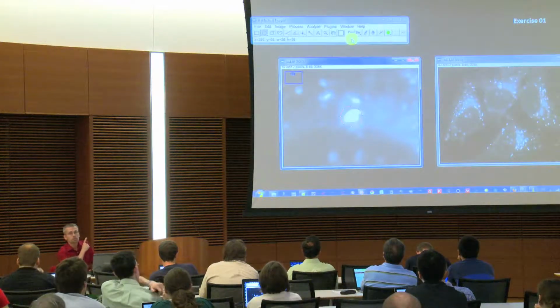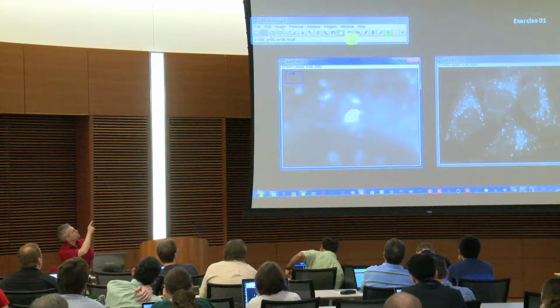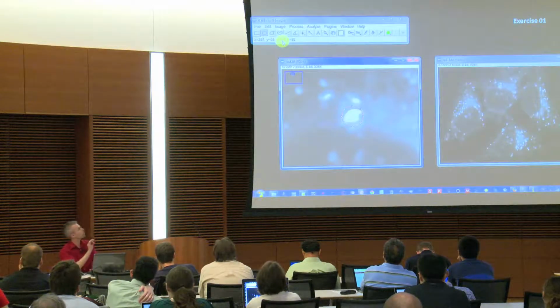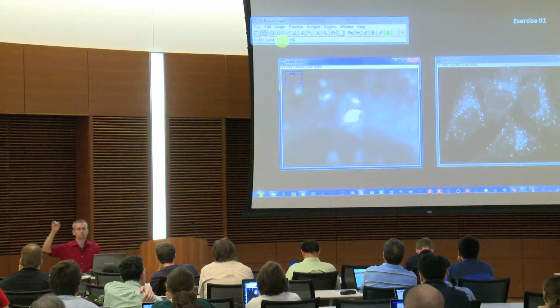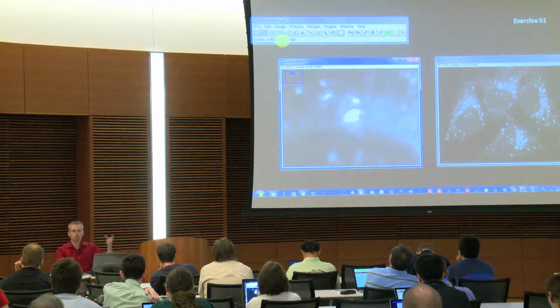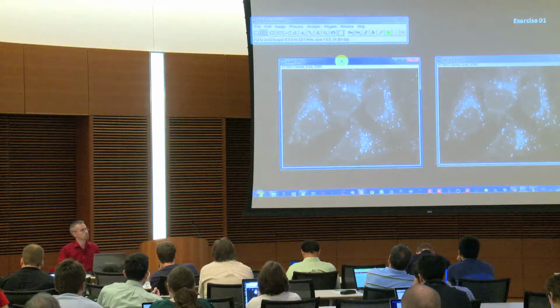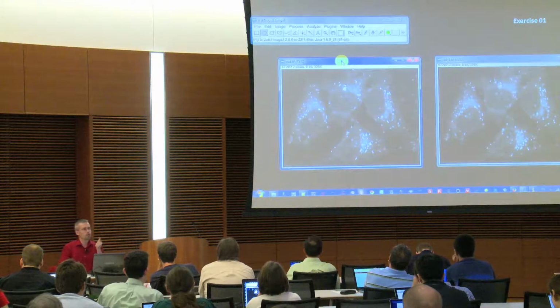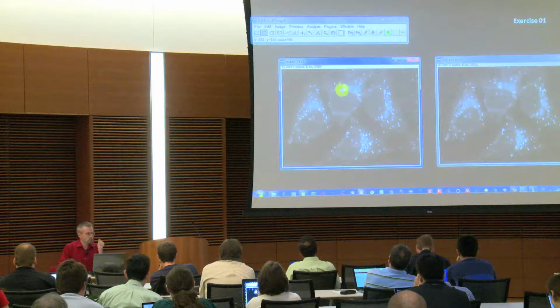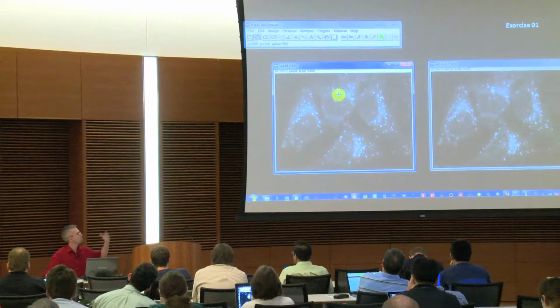For an image which has only pixels, not micrometers or something like that, you need to do it slightly different. If I move that, you get up here the position in X and Y, and you get W and H, which is the width and the height of the selection. For the perfect circle, that is our diameter. So this is approximately the size of the biggest feature. This is the rule of thumb which is also mentioned in the ImageJ user guide: we should use at least double the size from what we get here. So for the radius, this would be exactly what we measured.